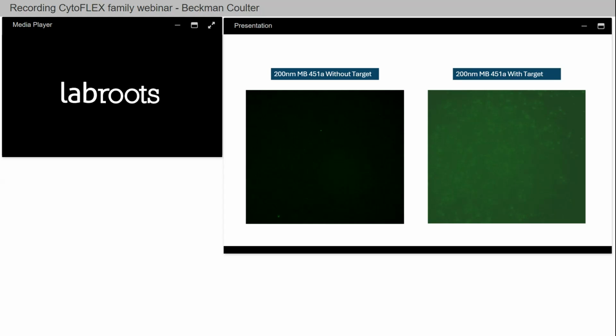So these are the 200 nanometer beads alone without the actual ability to fluoresce. And then we have all these little blotches, as I see them on my end. Hopefully they come up better on your end, that are green from the FAM.